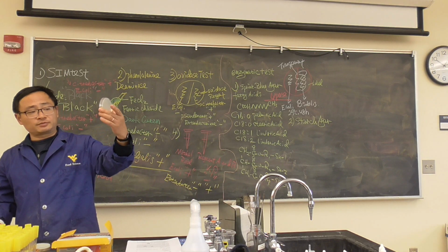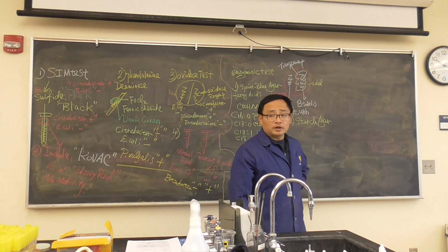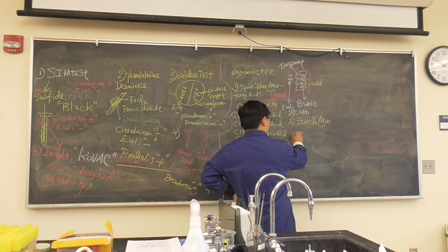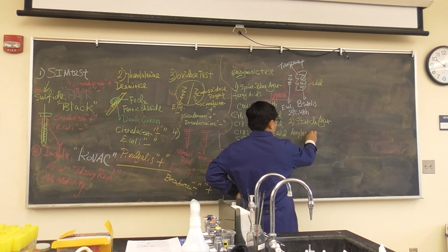There is no difference compared to all the others, it looks like. So what is starch? What are the major components of starch? Anybody? Amylose and amylopectin.